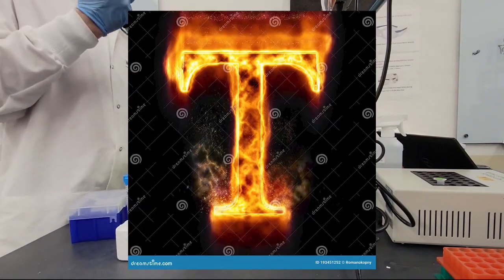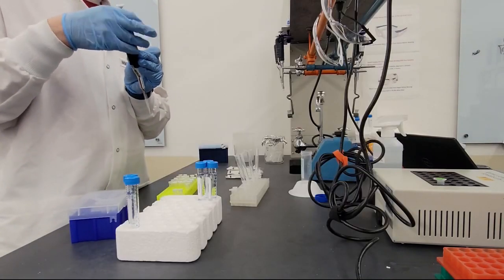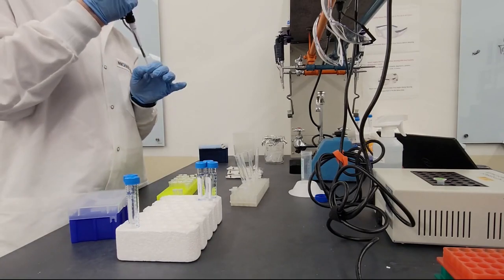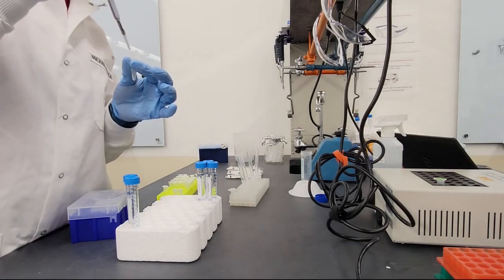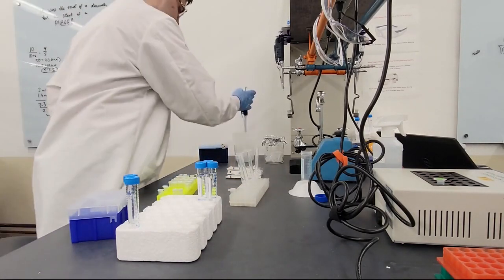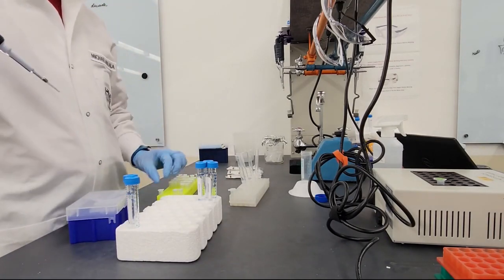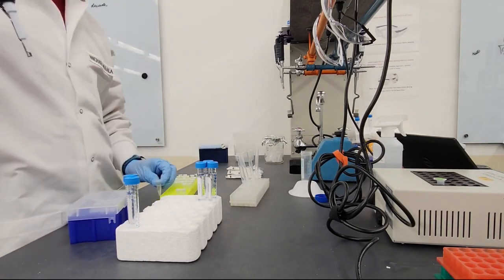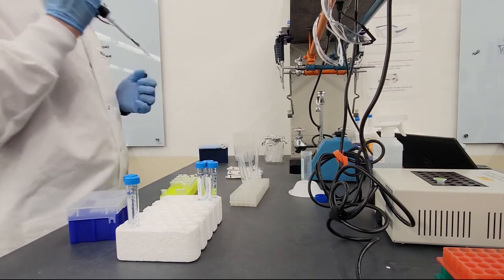Which, from there, we're going to put it in the incubator for 10 minutes and have it actually degrade the proteins, breaking down the capsid. And after the 10 minutes are up, we have to quickly rush to add EDTA. This stuff is basically going to calm down the nuclease and protect the actual nucleotides. So it's a race. Who's going to get there first, the nuclease or the EDTA? And we have to pray that the EDTA gets there in time because otherwise, you have to redo this whole process again. And you don't know if you've screwed up or not until the very end because you actually can't see the DNA, right? You just see some solution of some liquid.